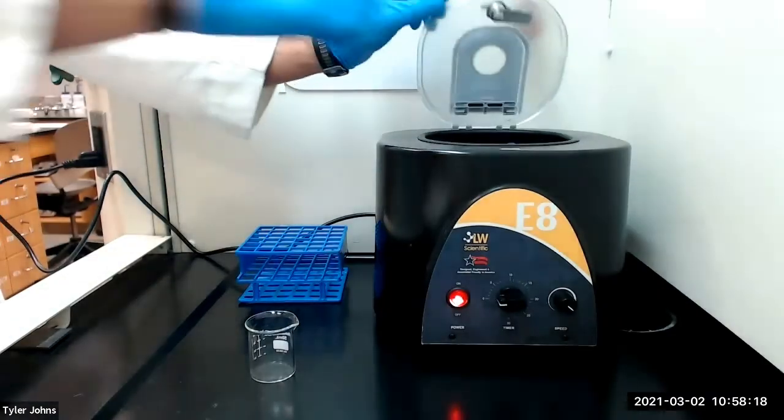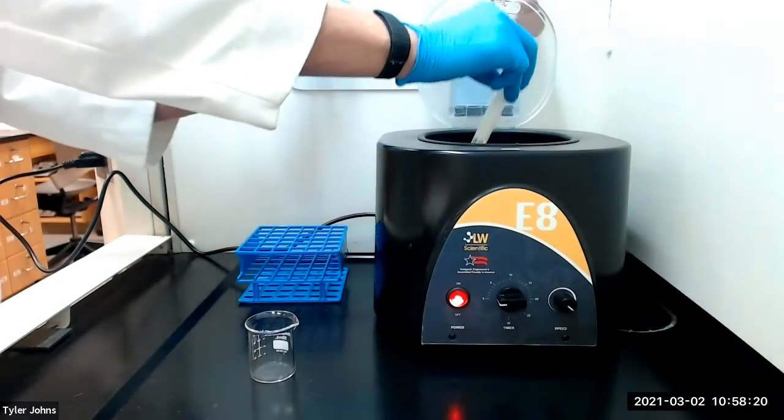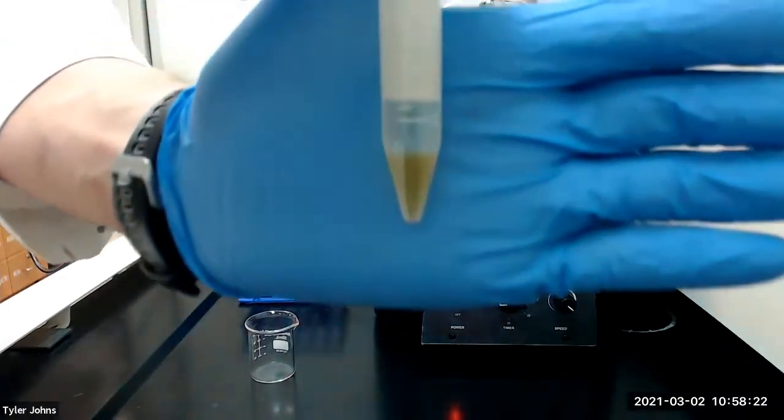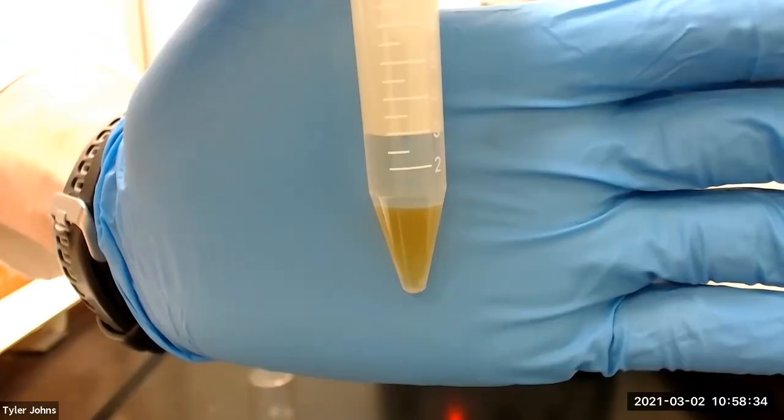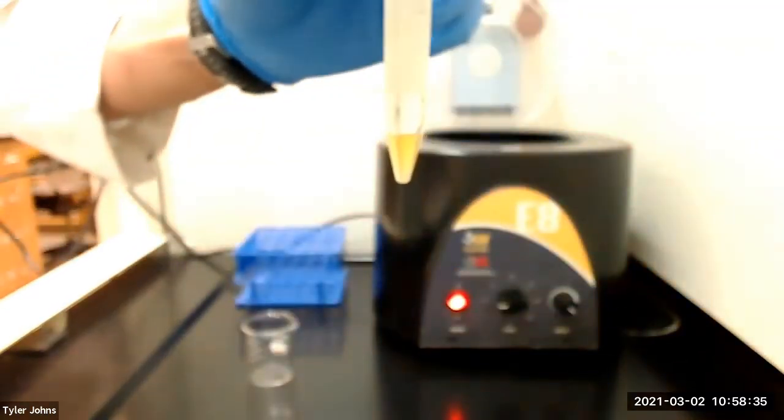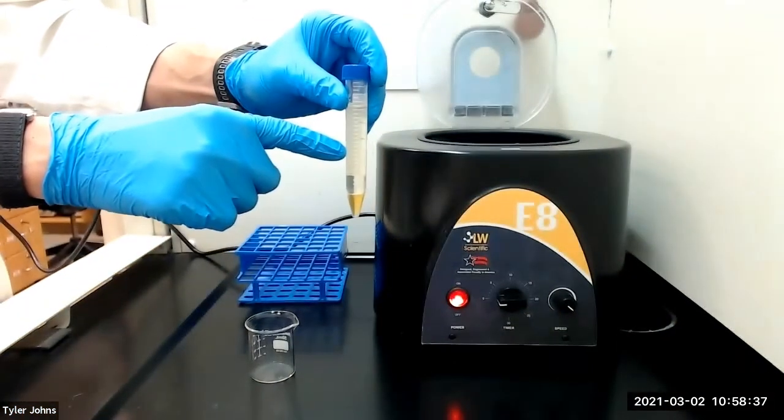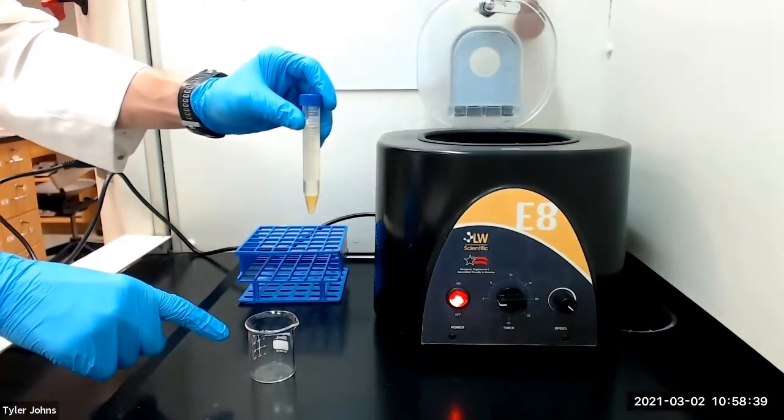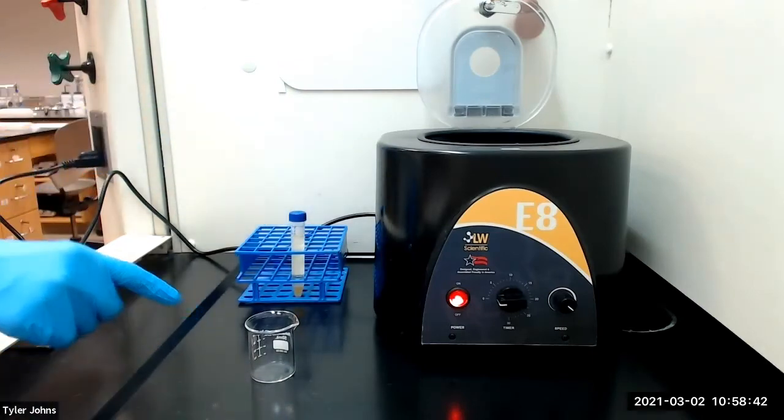This is what our mixture looks like after centrifugation. We will next transfer the top biodiesel layer to the pre-weigh 50 milliliter beaker using a pasture pipette.